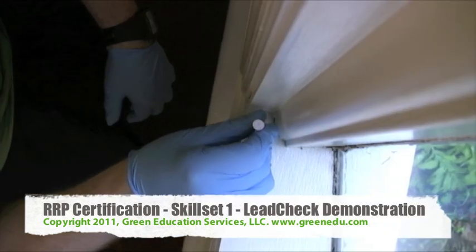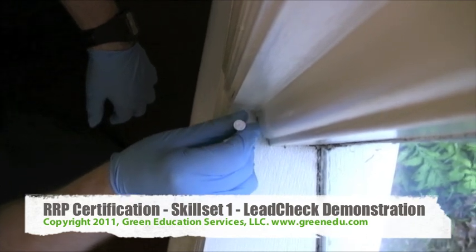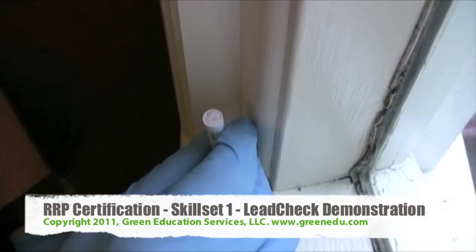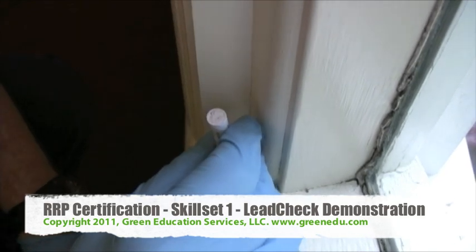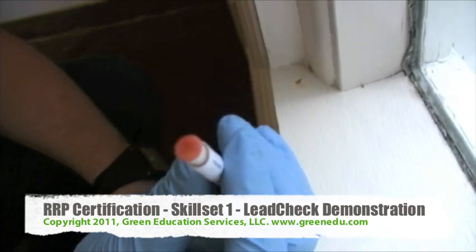For your actual test, gently rub the activated swab in the exposed area for 30 seconds. If any of the layers contain lead, a positive result will occur and the swab or surface will turn pink or red.